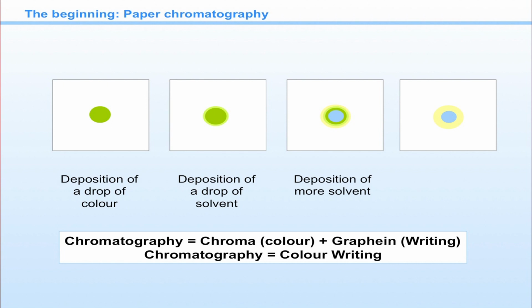And as I said, this is the mobile phase, and the stationary phase is going to be the Whatman filter paper. This Whatman filter paper has been graded into three: Whatman filter paper number 1, 2, 3. These variations depend upon the thickness of the Whatman filter paper, flow rate and the purity.